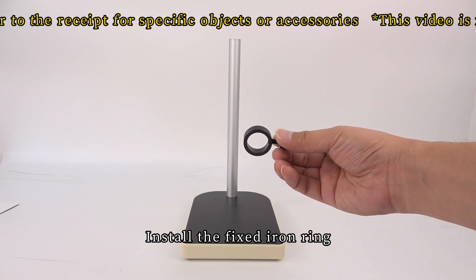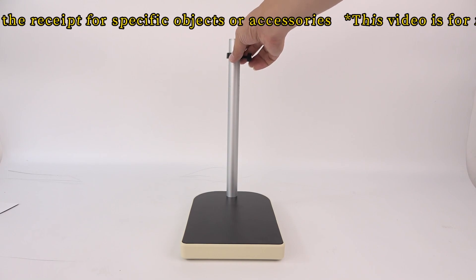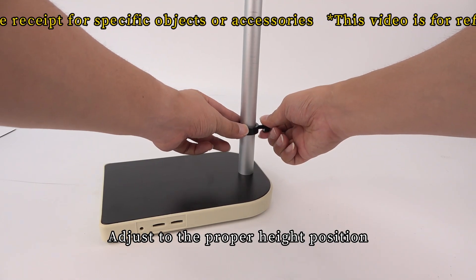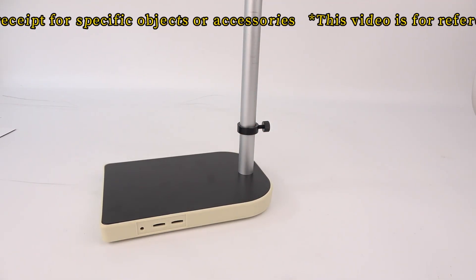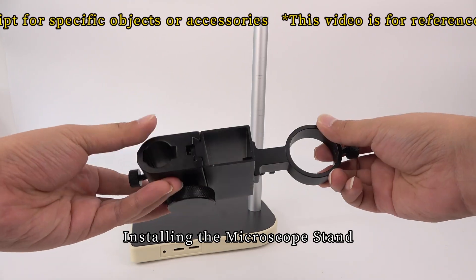Install the fixed iron ring. Adjust to the proper height position. Install the microscope stand.